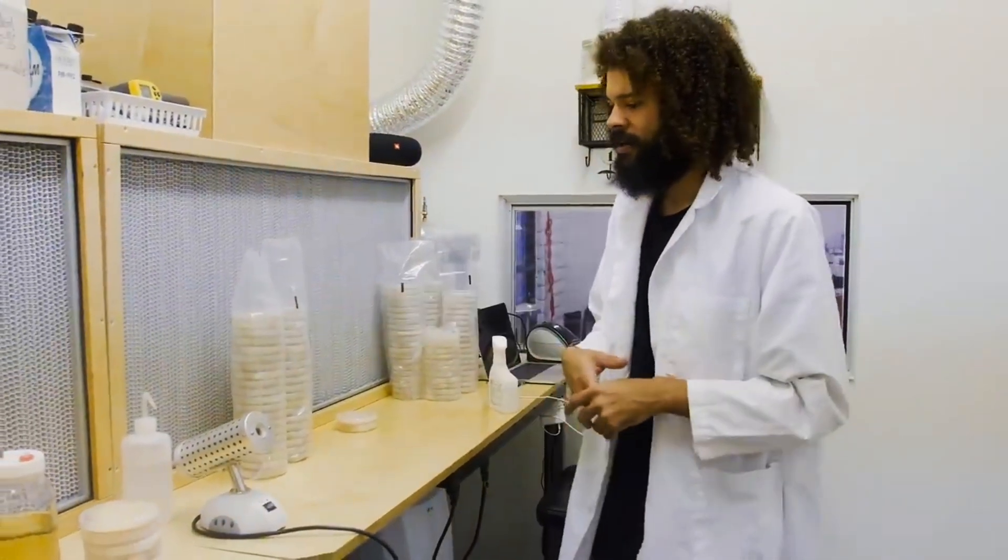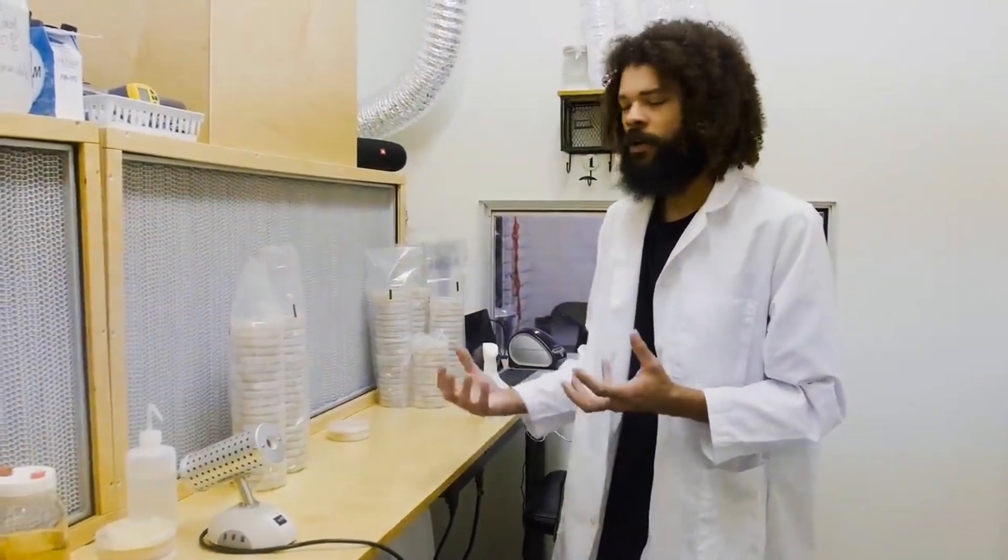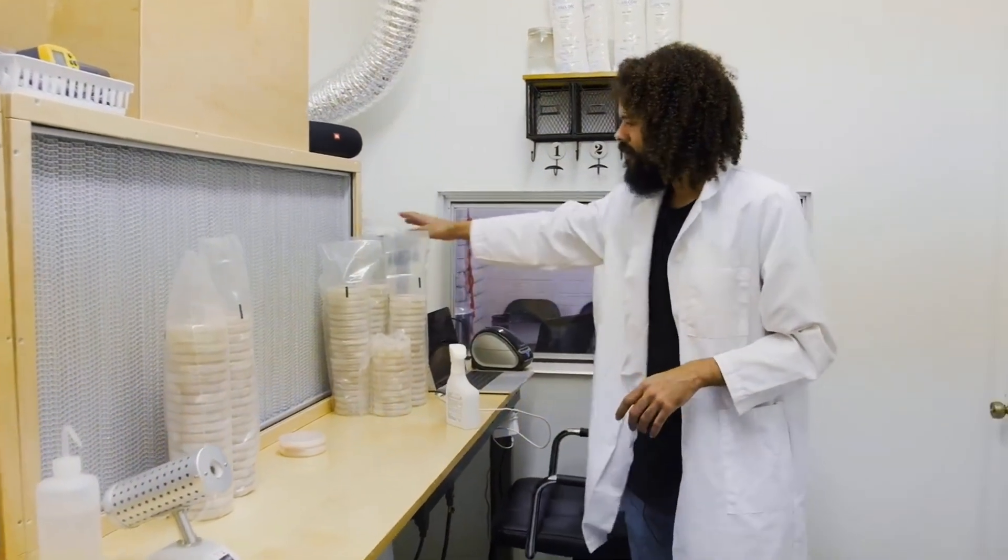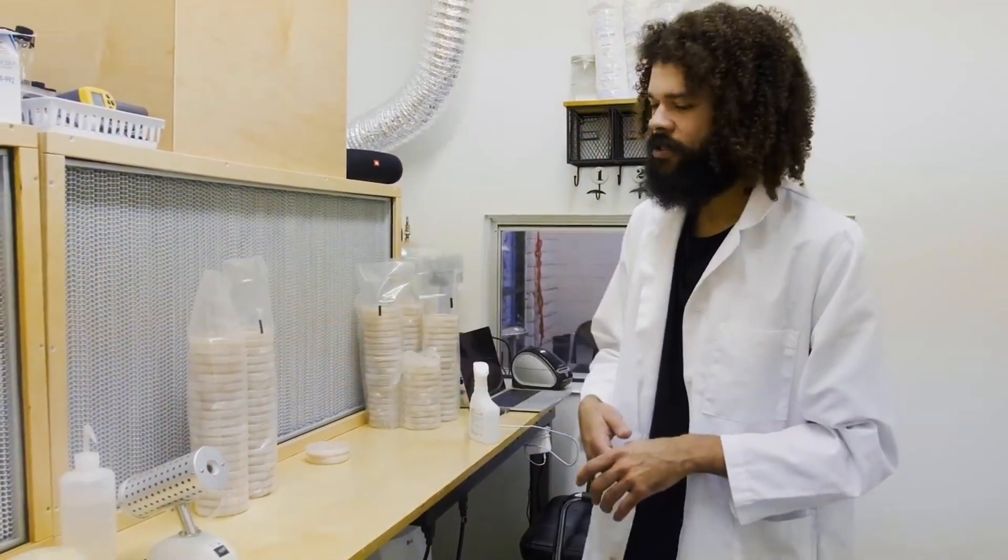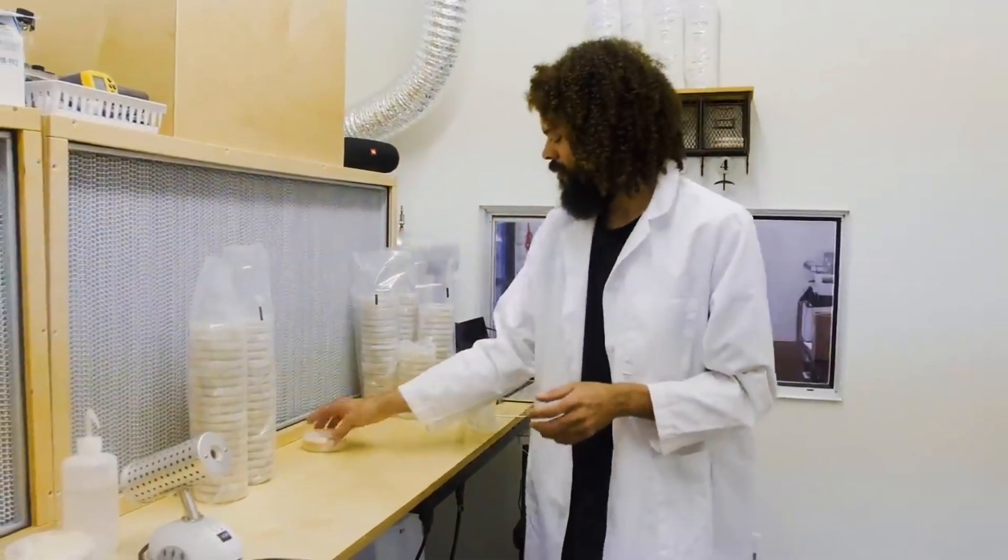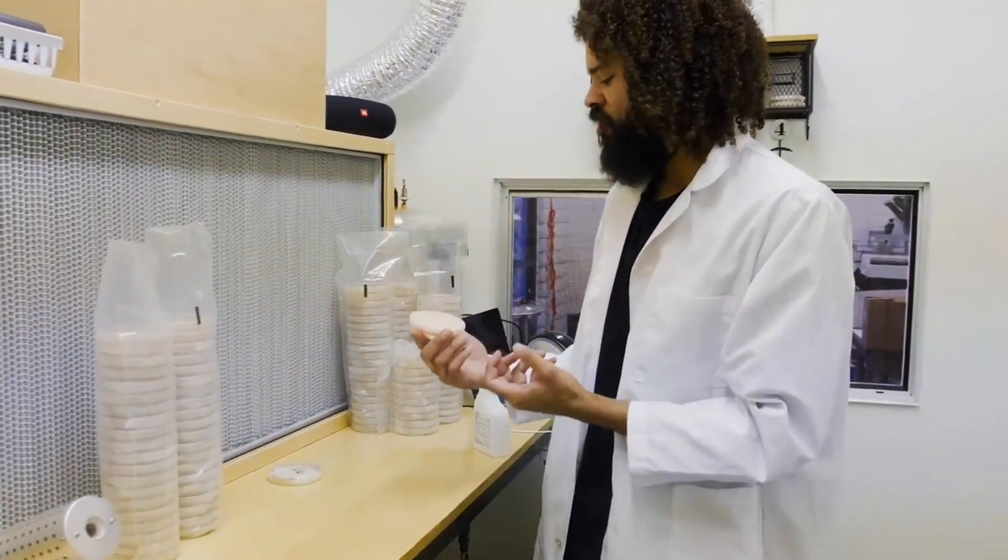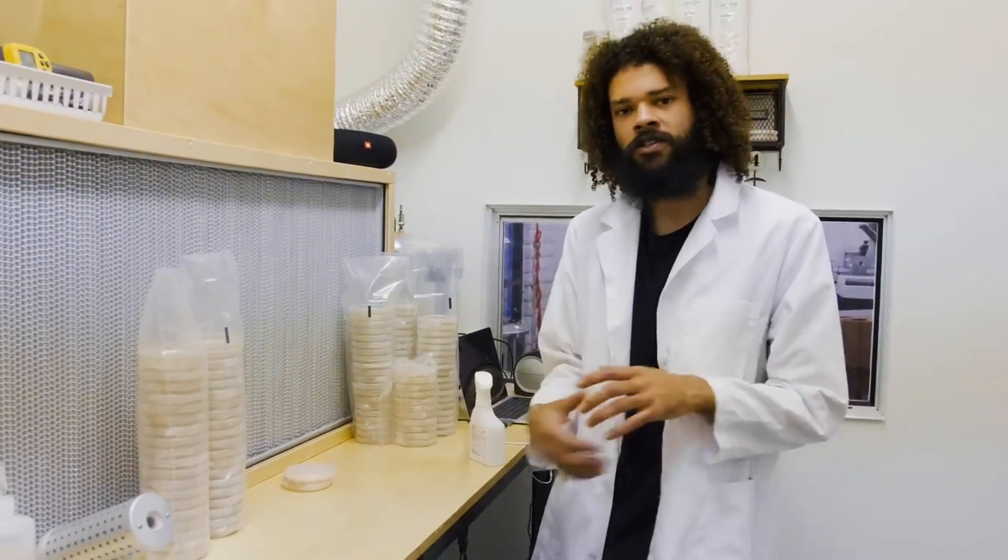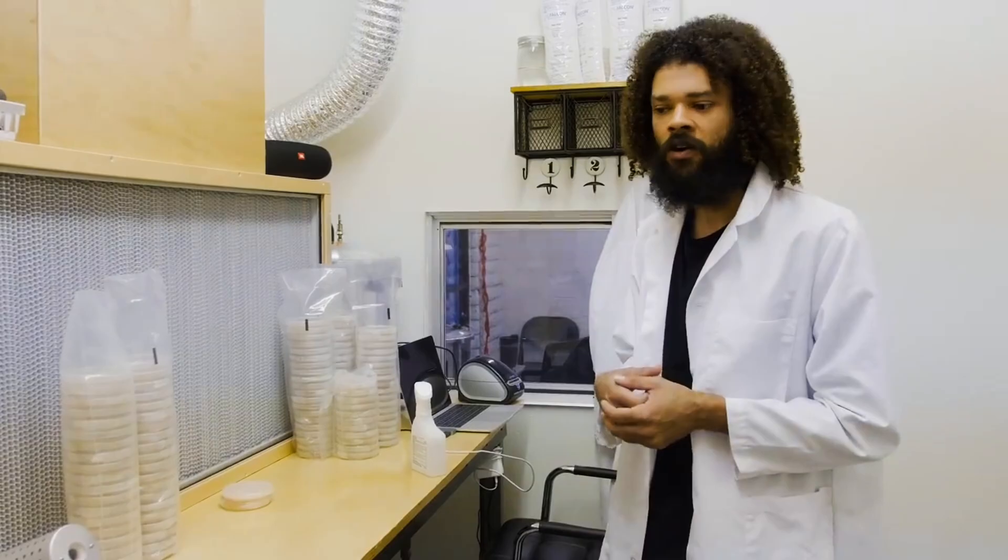This is prepared by mixing malt extract agar powder into one liter of water and then sterilizing in an autoclave. After that it's poured while still hot into these petri dishes and allowed to cool. Once it cools it solidifies and forms this nice two-dimensional surface that our mushroom mycelium can grow across, and we can select the healthiest spots of growth.